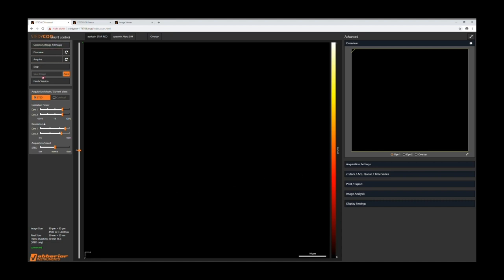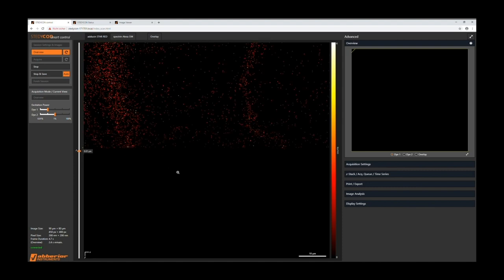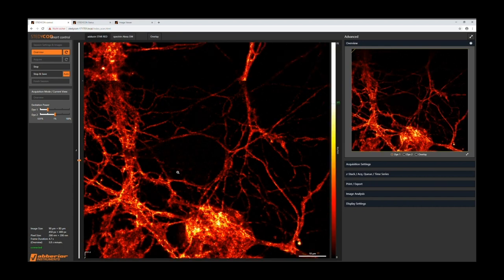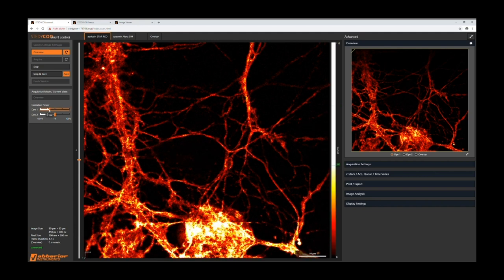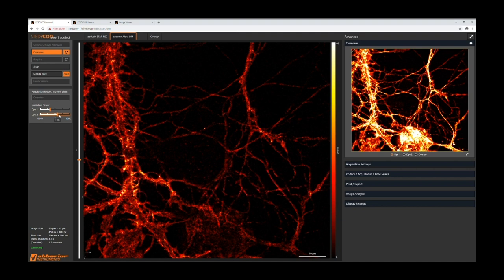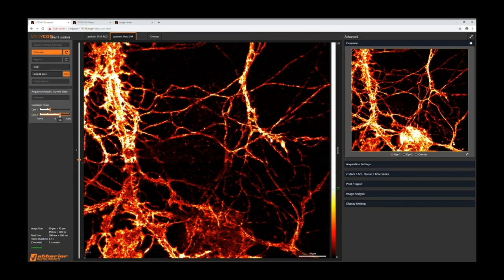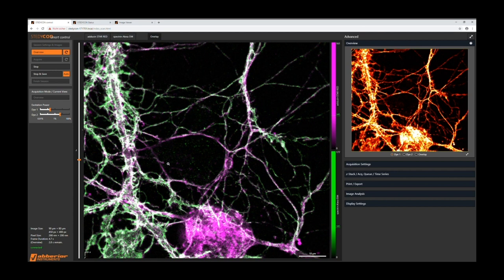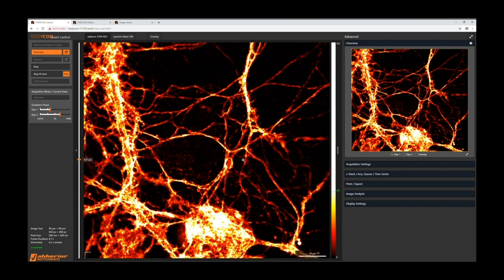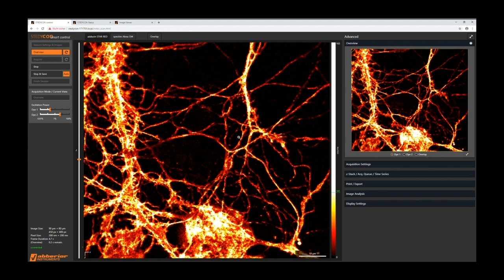This is how the STEDYCON software looks: on the left you have all the standard settings to set the STED and confocal parameters, and on the right there are all the advanced parameters like Z-stacks. First, we usually acquire an overview image. If you click on the loop, it acquires overview images continuously, which can be used to fine-focus by turning the mouse wheel. Here you already see really nice neuron structure. Now I change the excitation laser power to make it a bit brighter for dye 1 and dye 2, to get optimal settings first in confocal before optimizing for STED.